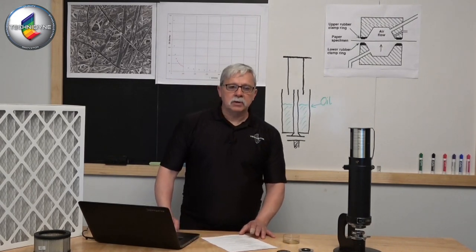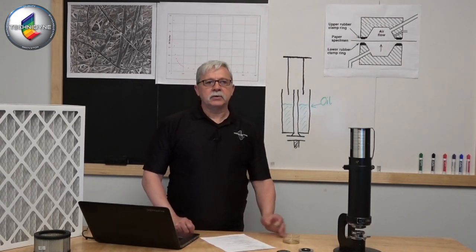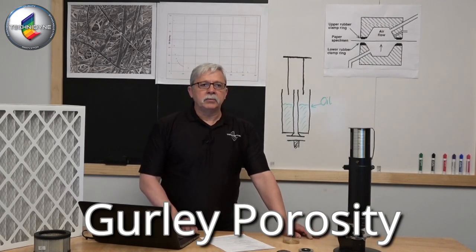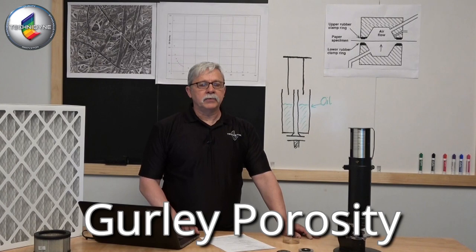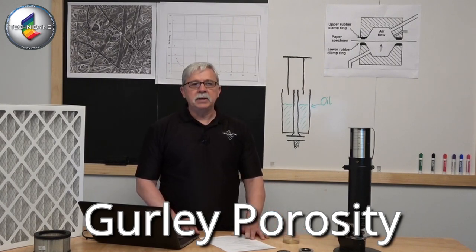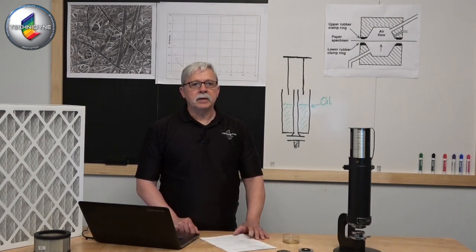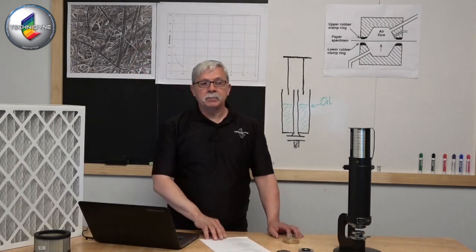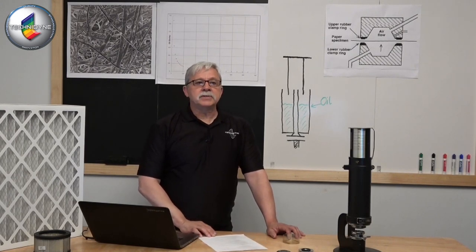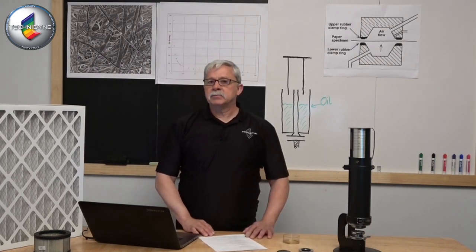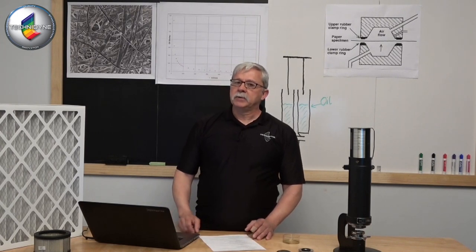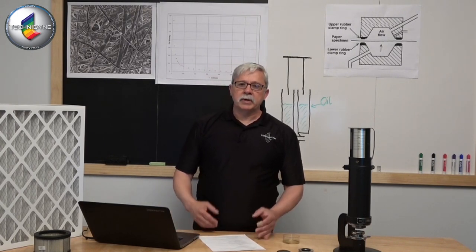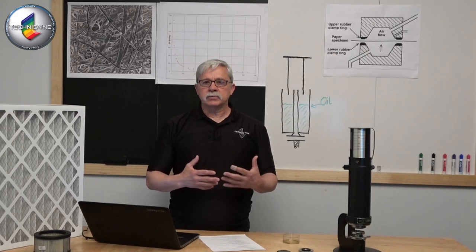Today what I'd like to talk about is kind of focus on the Gurley method. The Gurley method was developed sometime in the 1940s, became fairly popular here in the States as a means to analyze what that structure of our paper is all about and to give us some feedback on what happens when we make some changes on the machine. Are we changing the structure in such a way that it's tightening things up? Are we changing the structure in such a way that it's opening the web up?